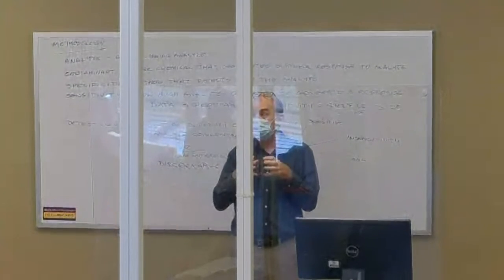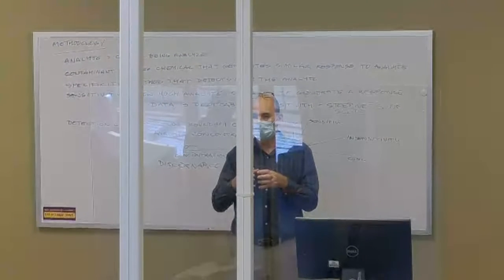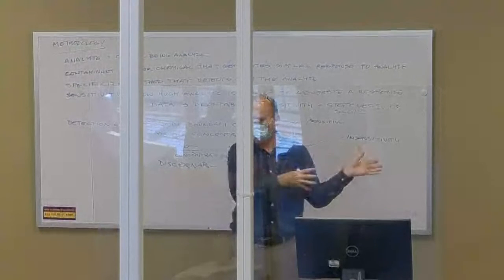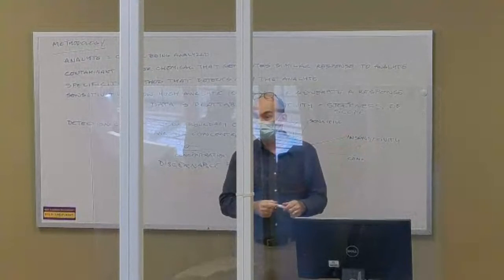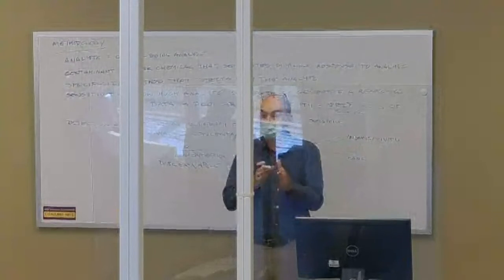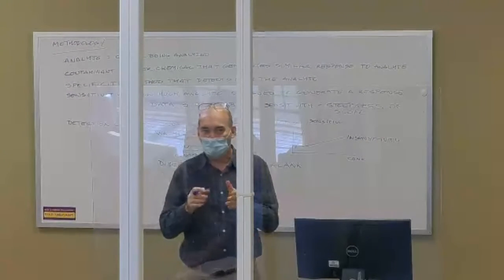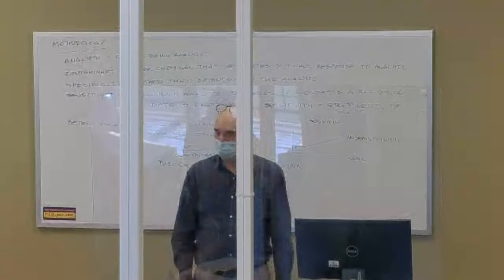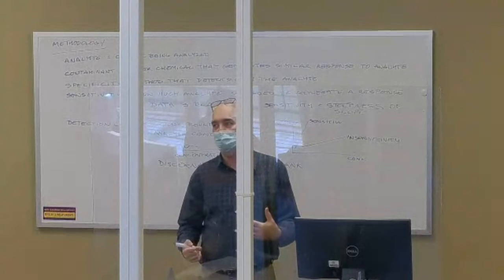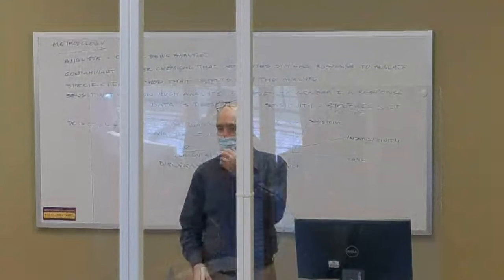So our blank can be multiple different types. One is it's just pure distilled water, or it is pure alcohol or solvents, whatever solvent we choose from the stock group. Or it's what we call a field blank, that it is similar in every way to the thing that you are testing, except we're pretty confident it doesn't have plutonium in it. If you're testing for plutonium, you test it against something that you are confident is similar to the thing you're testing, except it doesn't have it.